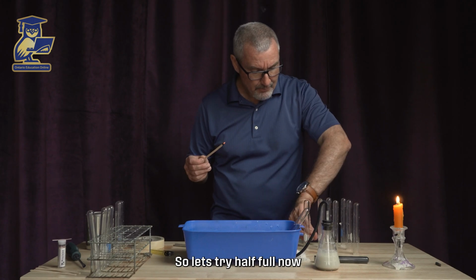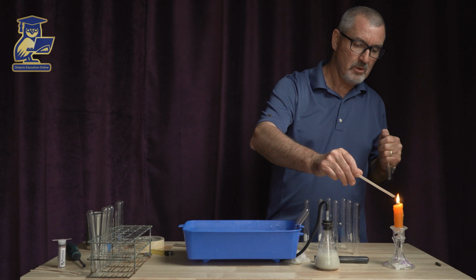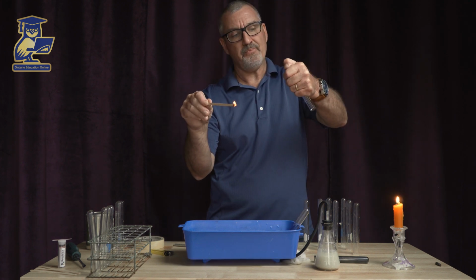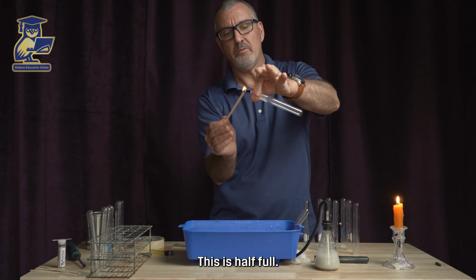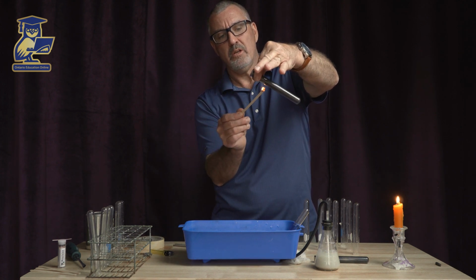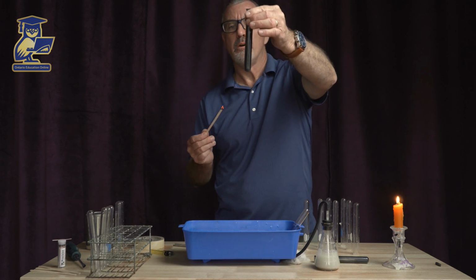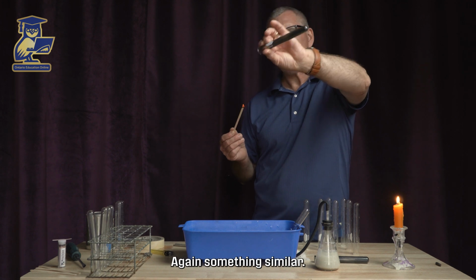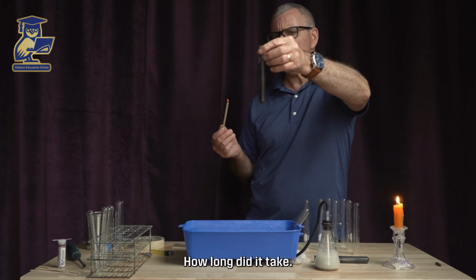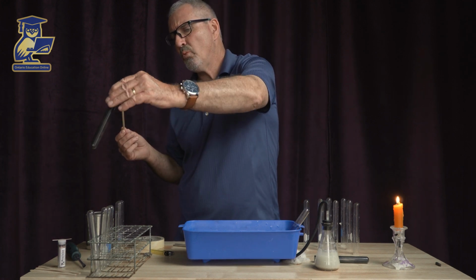So let's try half full now. Again, we have a lit splint. This is half full. Still have some burning right there. Again, something similar, not exactly the same. Look at the state of the test tube. How long did it take for it to burn? Where did it burn?